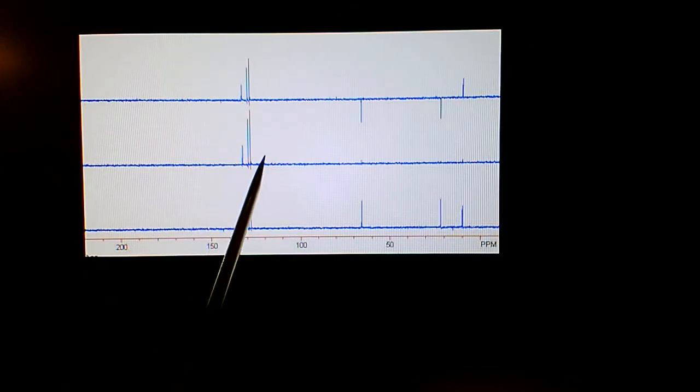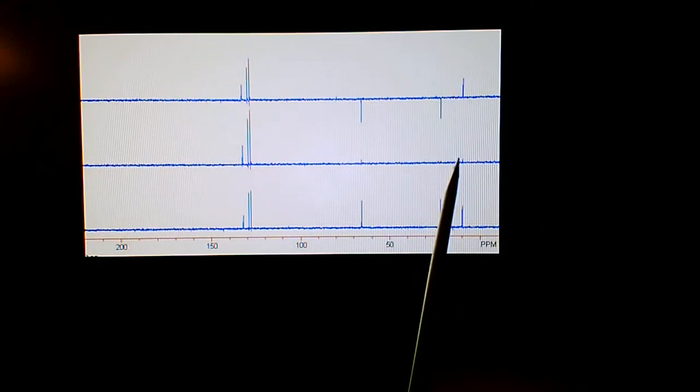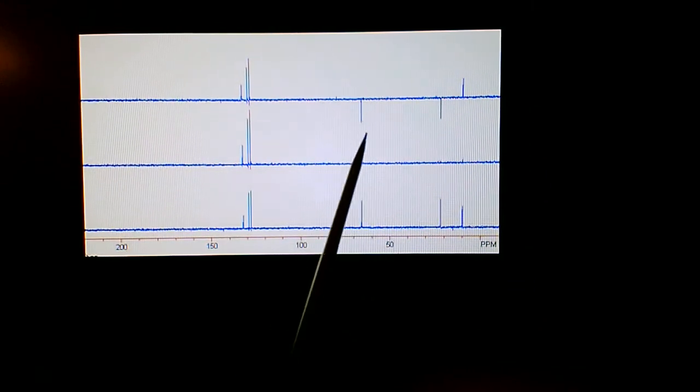Note that there's no other peak in there, so that tells me this one and these two are not CHs. You'll note, see how there's a little spud of a peak right there, a little bit right there, a little bit here, a little bit there. We call these artifacts. These are just residual signals because the instrument that took these spectra could not completely cancel out these peaks like it was supposed to. So you'll often see tiny little peaks in line with our other peaks, and those do not indicate CHs. Those are just tiny little artifacts.